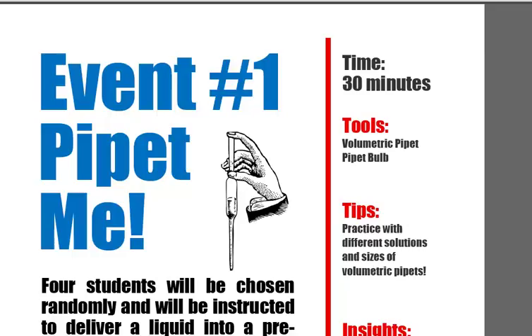Now, the first rule that I have to say is that if you do not have a volumetric pipette, then by all means, please give us an email or a phone call. We have tons of them in the laboratory that we would love to share with you. So we do not mind getting you different sizes of volumetric pipettes, putting them into a box, wrapping them in bubble wrap, and delivering them to you where you need them. And we'll also give you the approved, appropriate volumetric bulb to use as well.